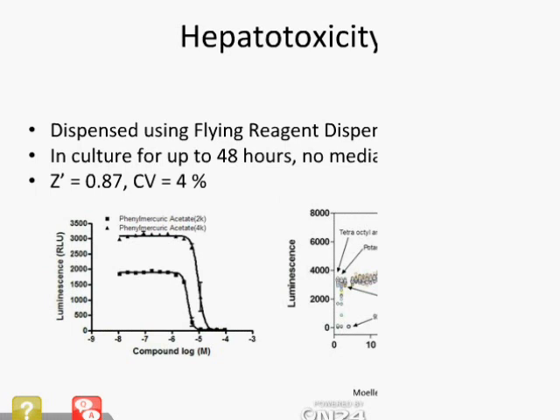From this system, high-throughput screening may be used to rank order hepatotoxicity potential and may be a warning for future in vivo outcomes.